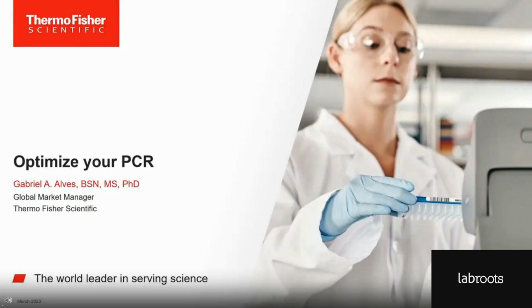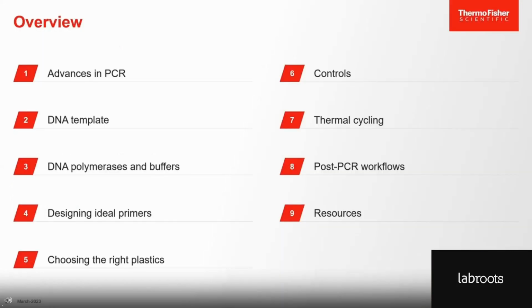Hello, I'm Gabriel Alves, and it is a pleasure to be your host today for this webinar. Today's topic is about optimizing your PCR. We will go through the individual steps of the PCR workflow and review their function and meaning. Along the way, we will mention common pitfalls of PCR and how to avoid or troubleshoot them. We are going to talk about advances in PCR, DNA template, DNA polymerases and buffers, designing ideal primers, choosing the right plastics, controls, thermal cycling, post-PCR workflows, and also resources.